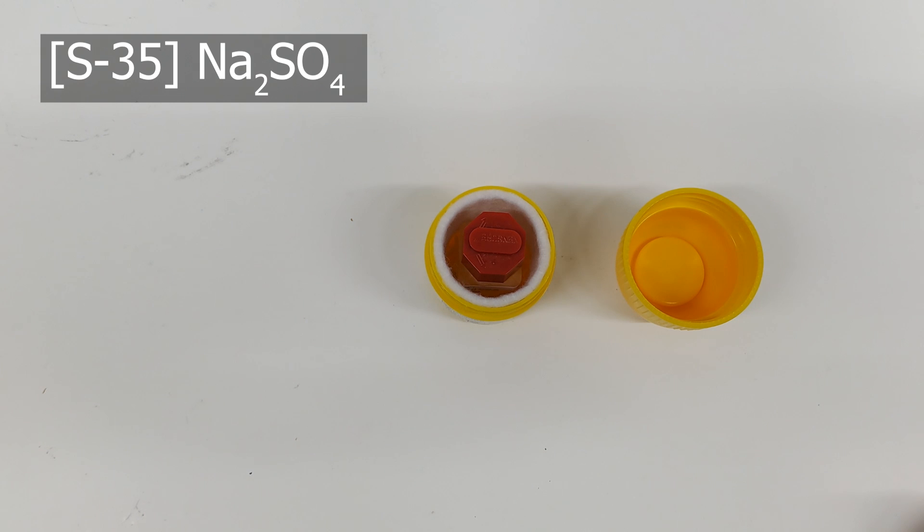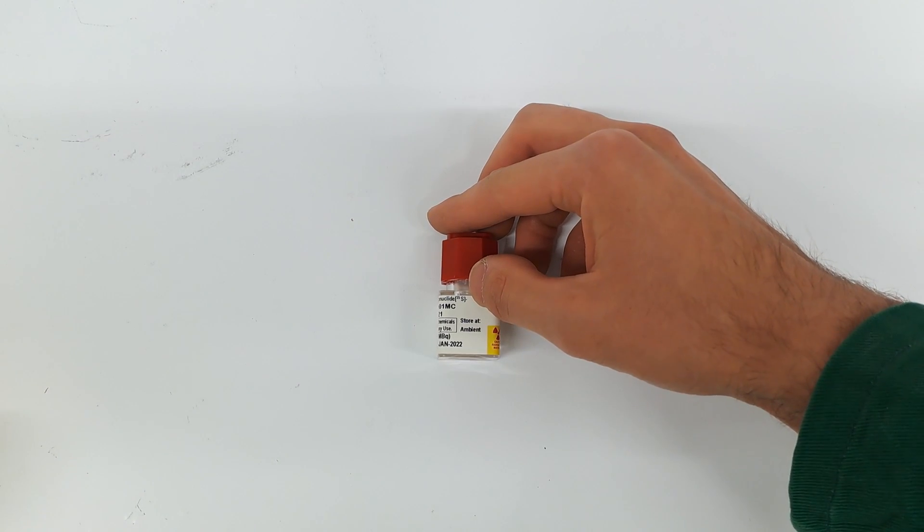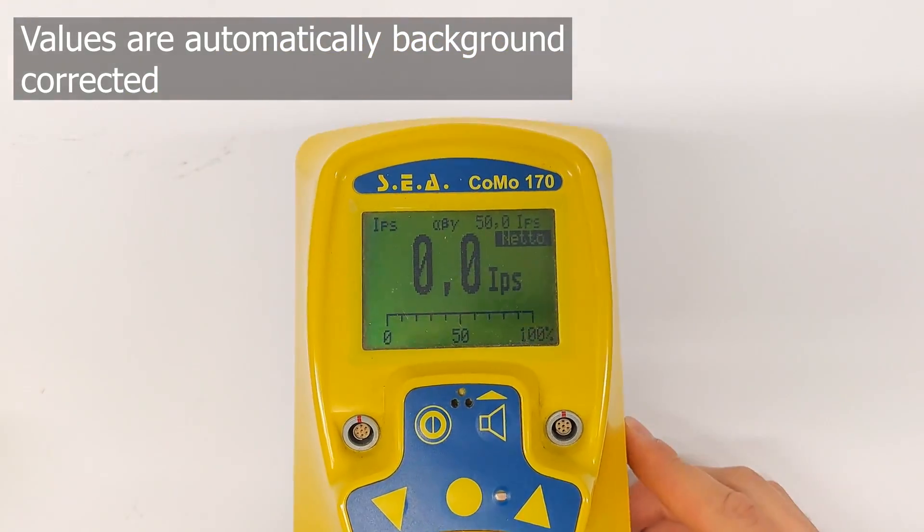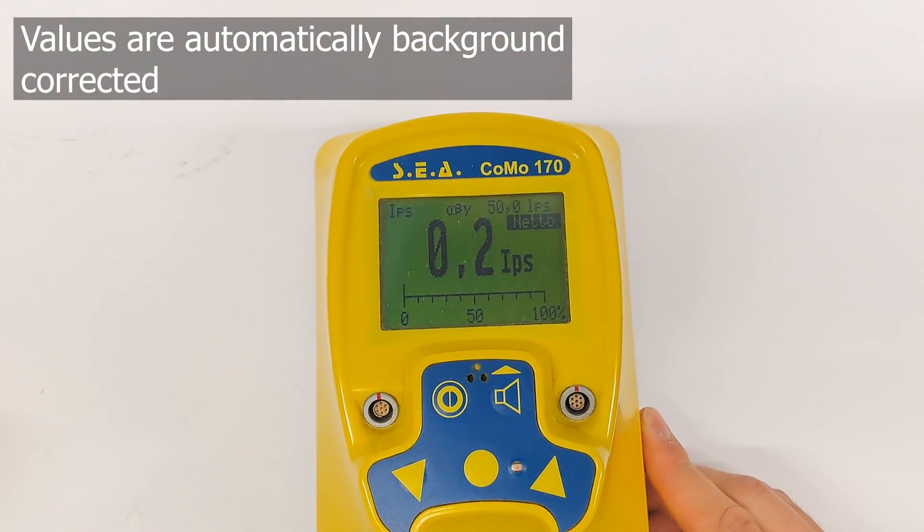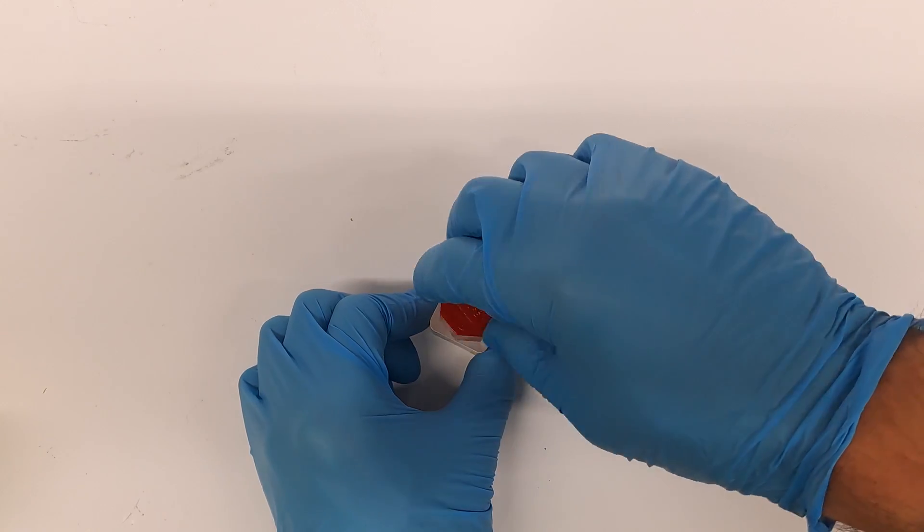Lead is generally unfavorable for beta emitters due to Bremsstrahlung or breaking radiation. I do not measure anything until I open the lid and only then do I realize that this solution is still radioactive enough.